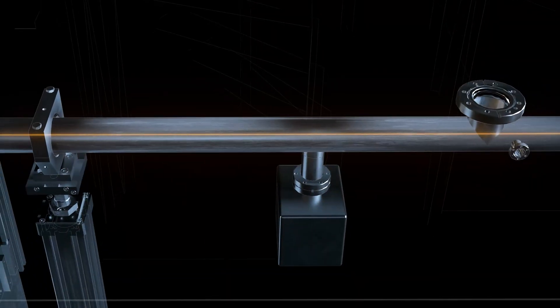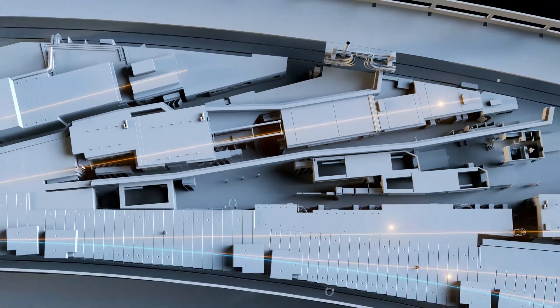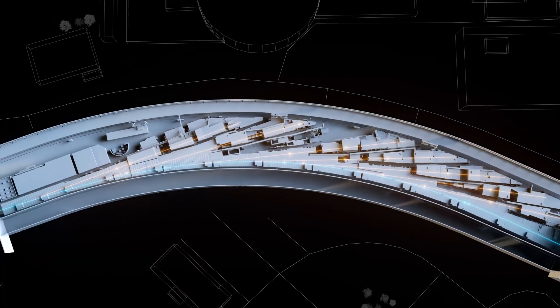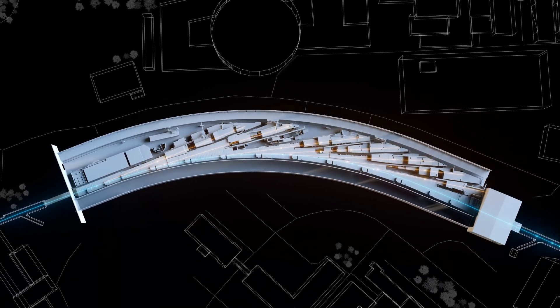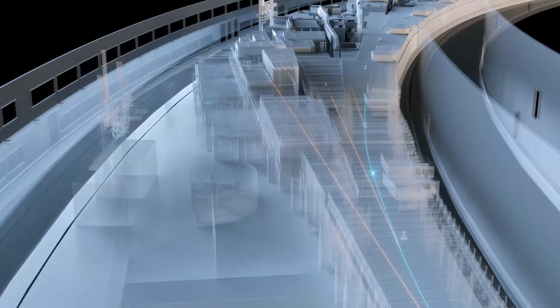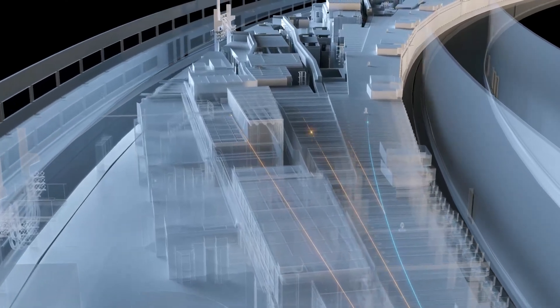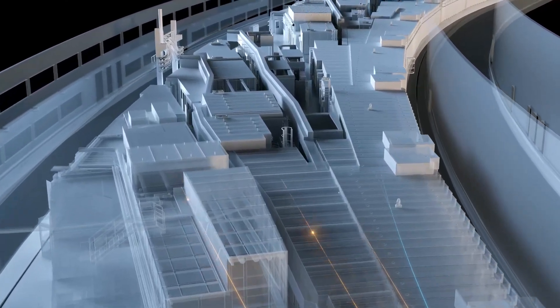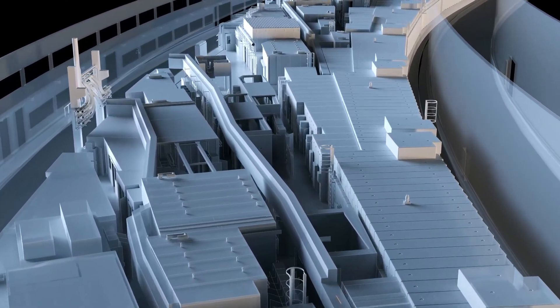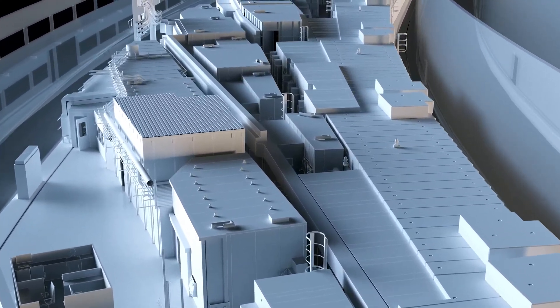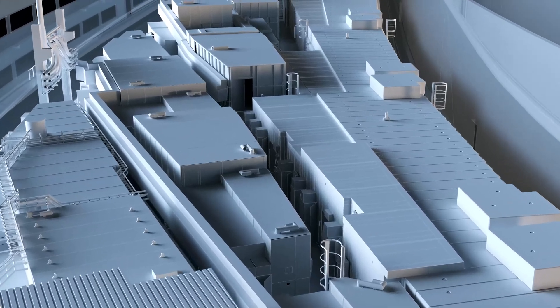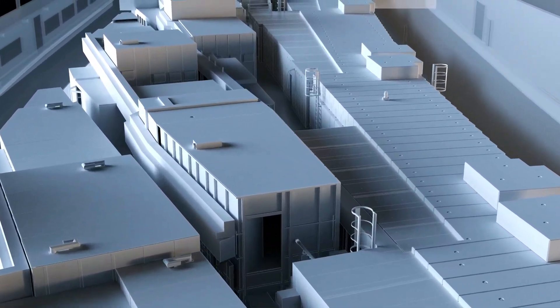That makes them ideal tools for investigating atomic structures. More than 20 beam lines direct the x-rays to around 50 experiment stations. The experiment stations at PETRA 3 are set up for different experimental methods and scientific research questions, such as researching the interior of the earth or other planets, or investigating tiny and complex samples.